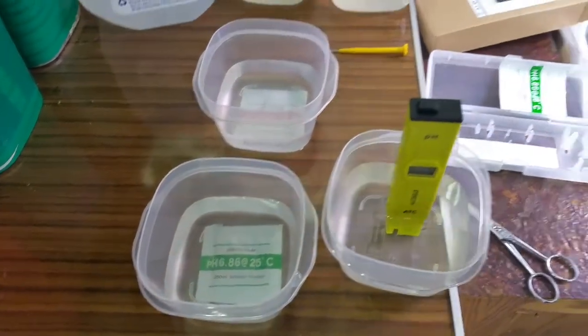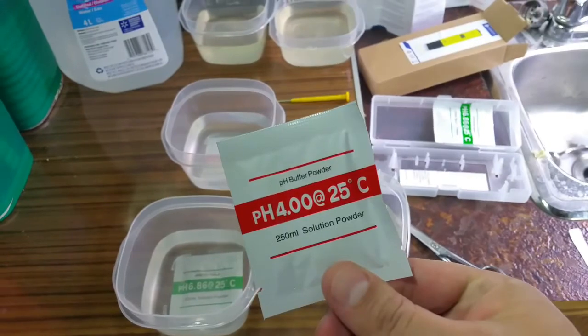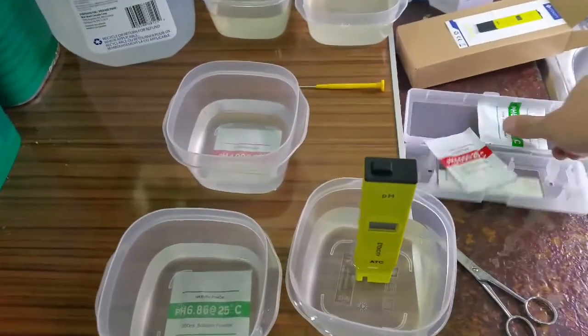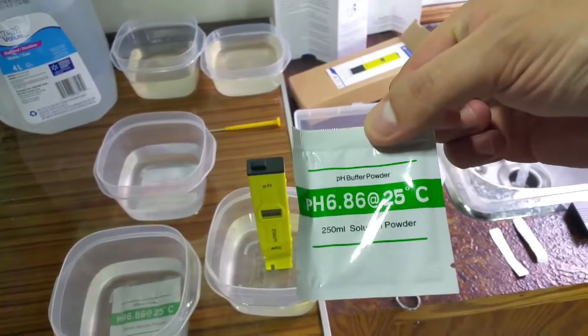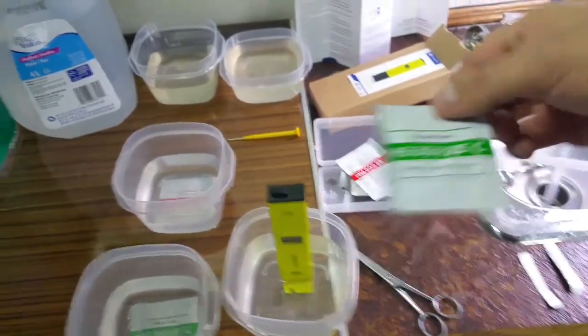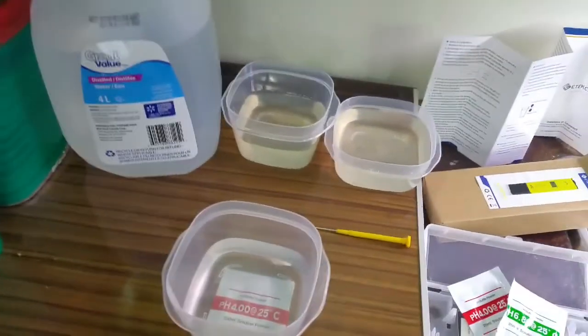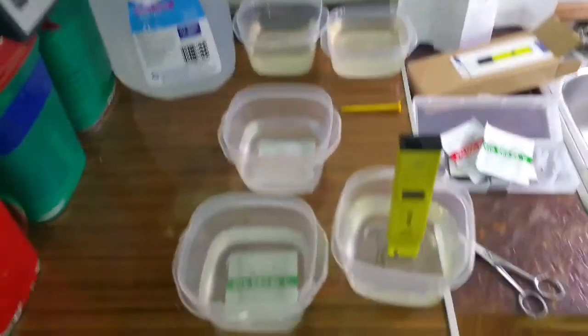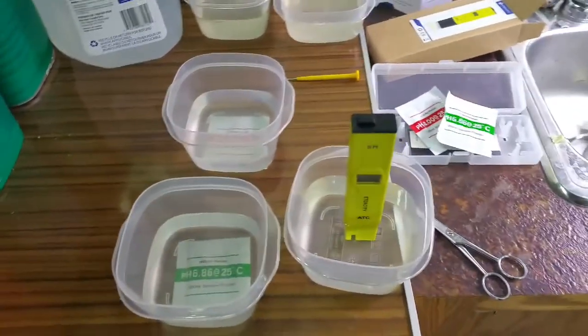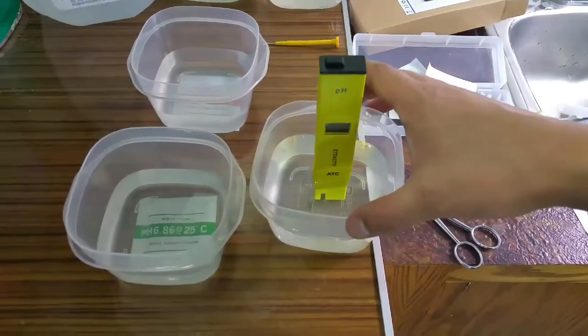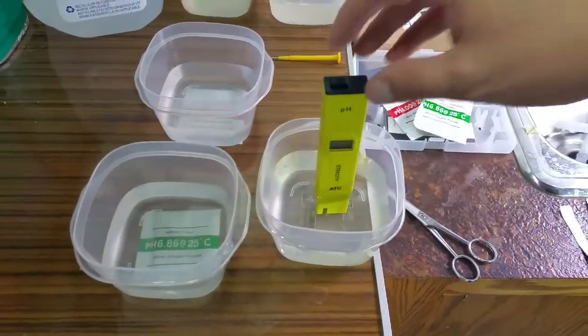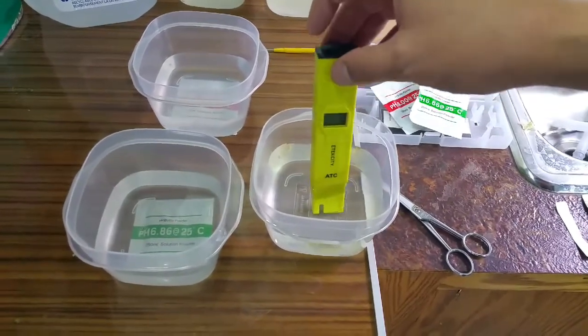They give you set pH packets you mix up with 250 milliliters of distilled water. I've got a bunch of different tubs going here. This one is just distilled water. You soak your meter for 10 minutes to start when it's brand new right out of the package.